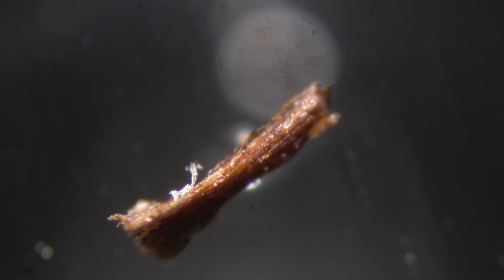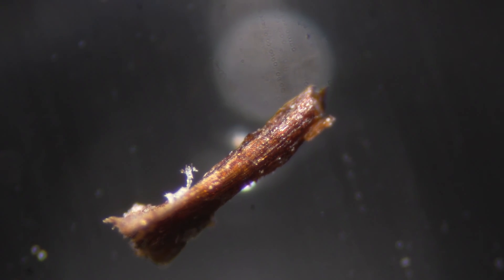But it's really pretty cool. So if we start from the top, we can see a lot of the skin cells there. It was in there wide end first — you can see all those little skin cells, all that little white stuff. Kind of looks like a little horse or like a giraffe eating or something. And if we go a little bit further down, we can see all the fibers. It definitely looks like a piece of something that's wood. I found it really interesting — not as interesting as the little girl did, obviously, but interesting nonetheless.